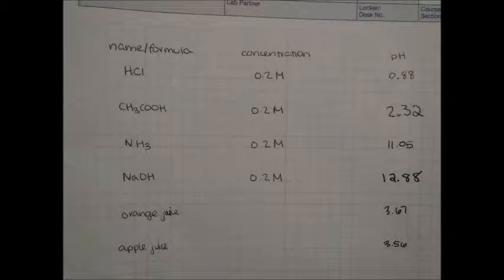By the time you have found the pH of all the solutions, your lab notebook should have a filled out data table that resembles the picture shown. You are now ready to complete this lab on your own.